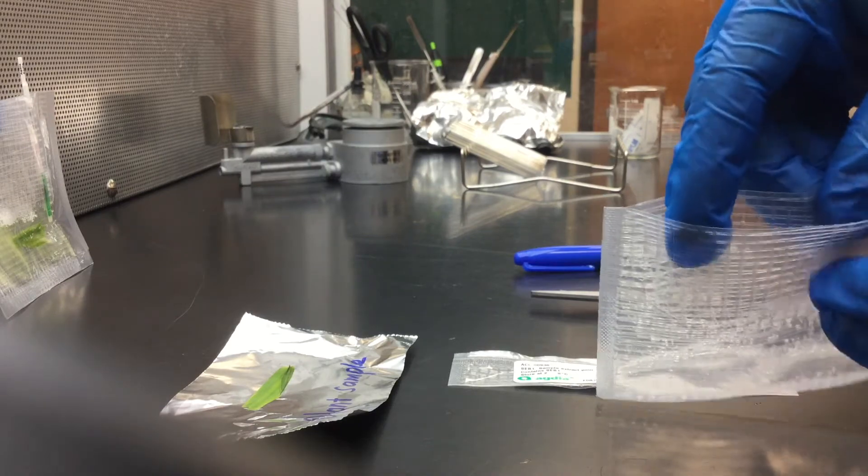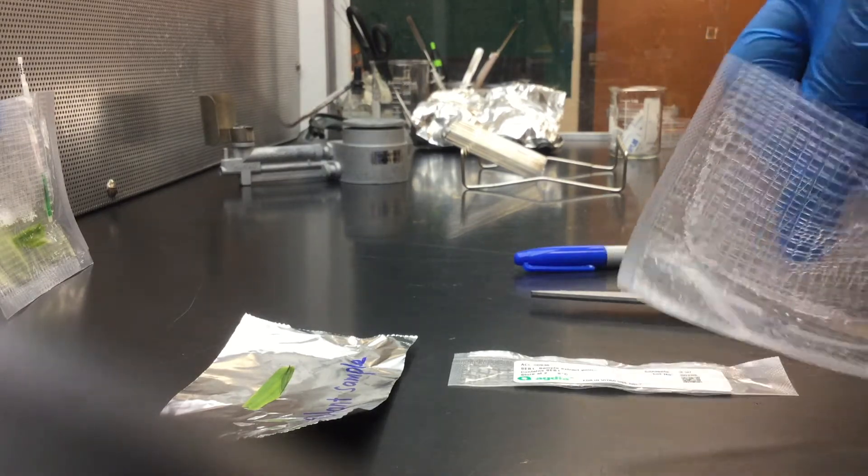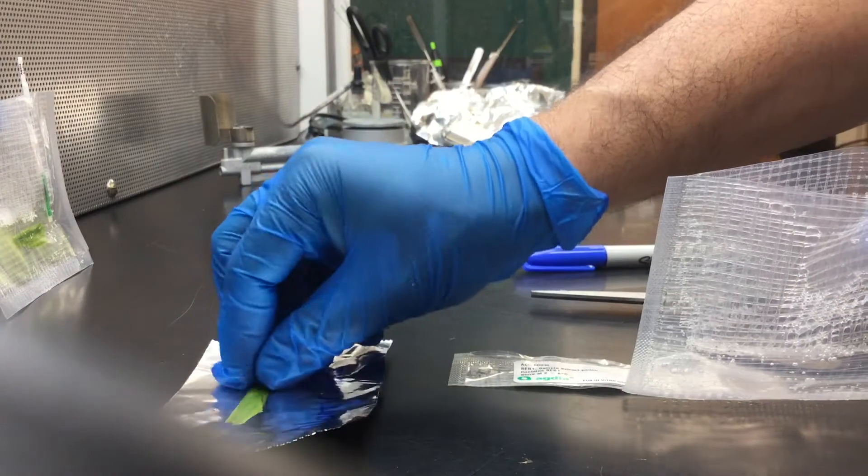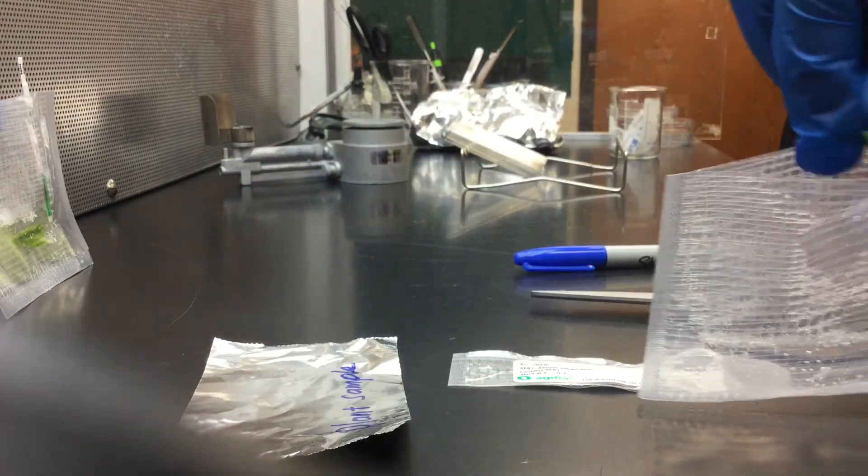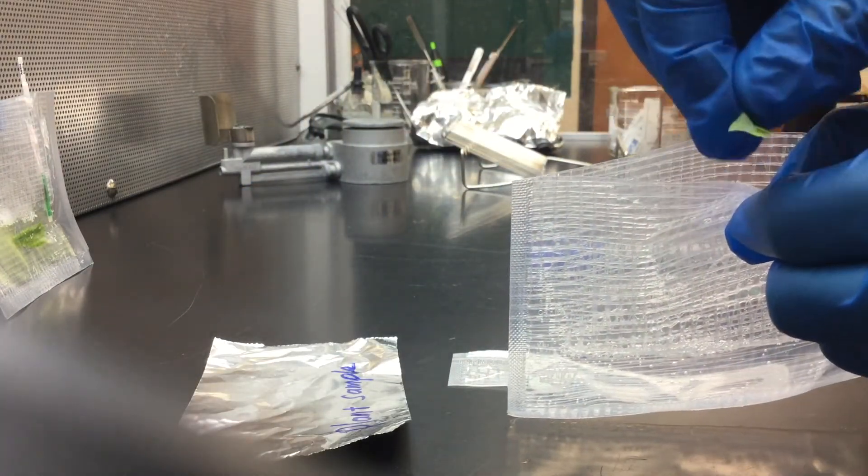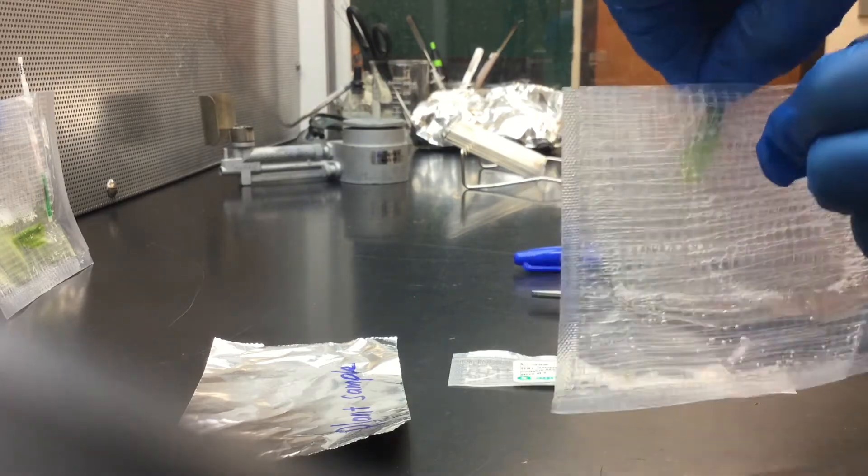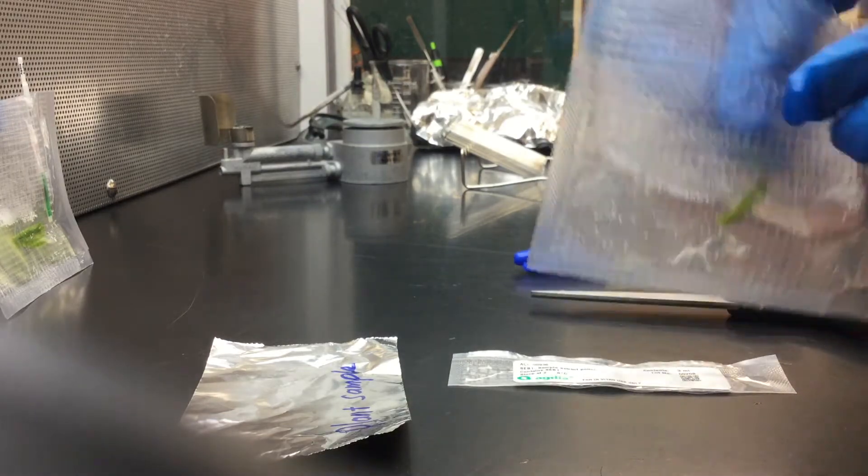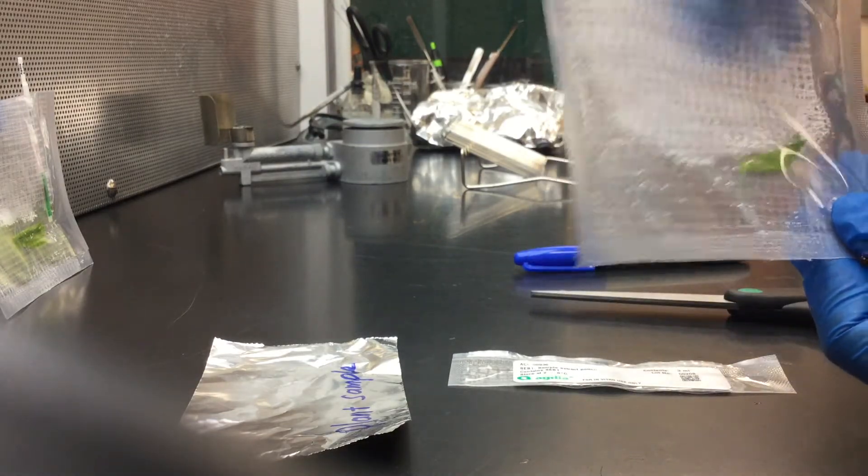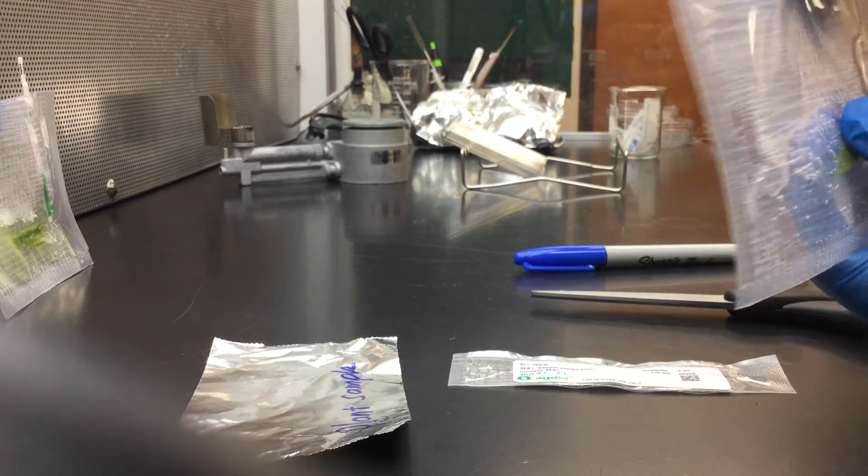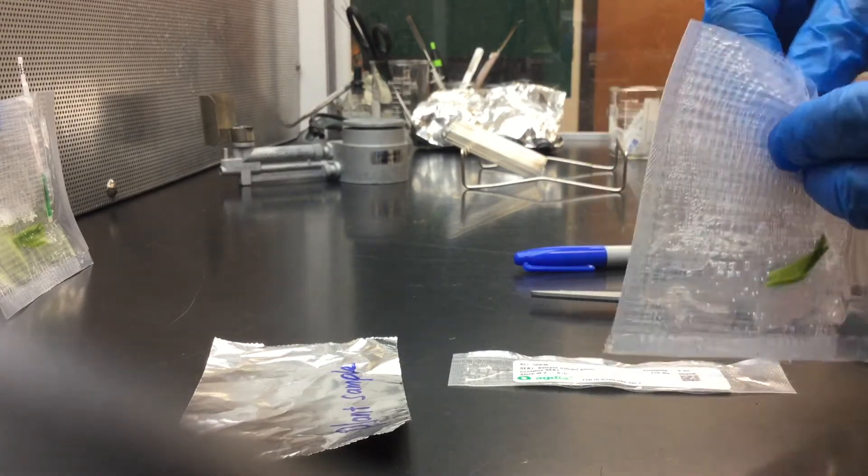Insert the leaf sample between the mesh lining into the buffer near the bottom of the bag so that the leaf sample is submerged in the buffer.